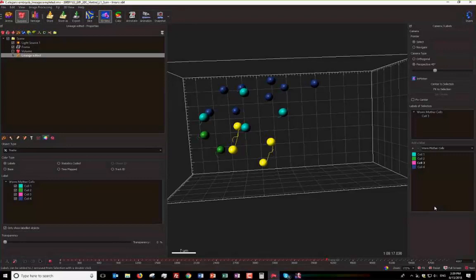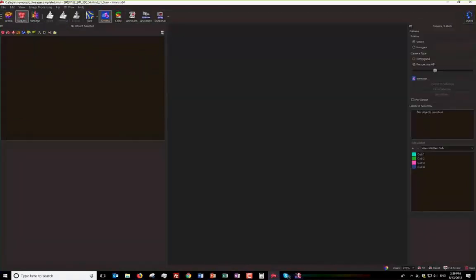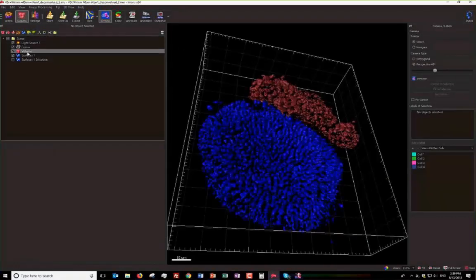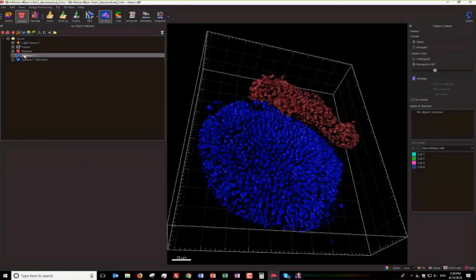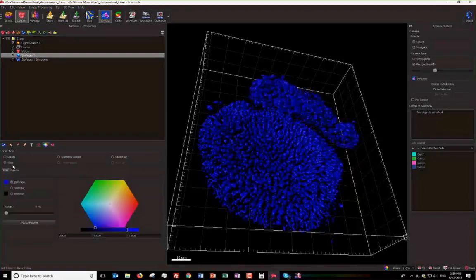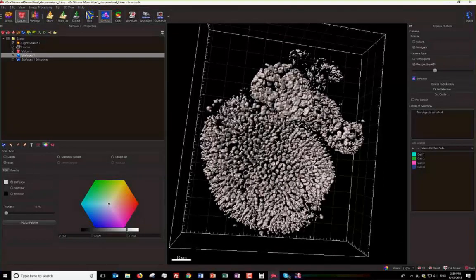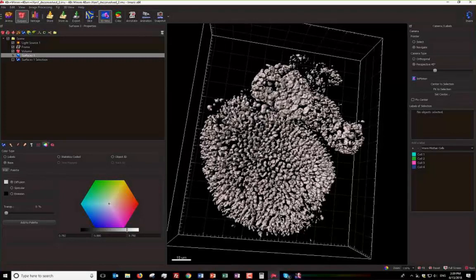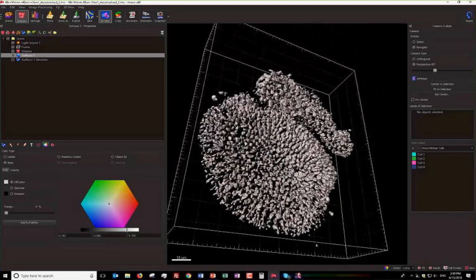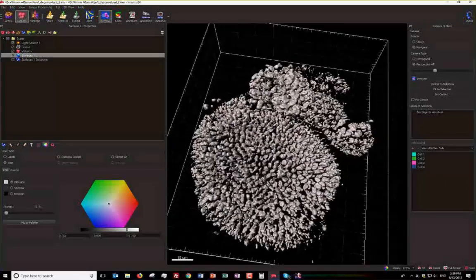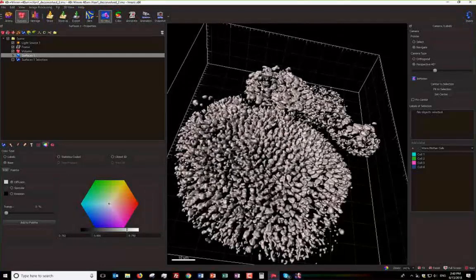I saved the best for last — switching to one more image. This is an organoid image where the main circular portion has been reconstructed as surfaces, with individual DAPI-labeled nuclei reconstructed as well. There's a separate chunk in the top right that is distinct from the main body. I can imagine wanting to look at these two regions separately, which would require selecting all the surfaces in that separate region.